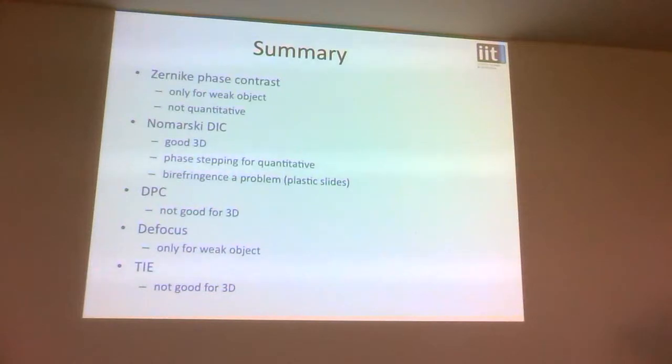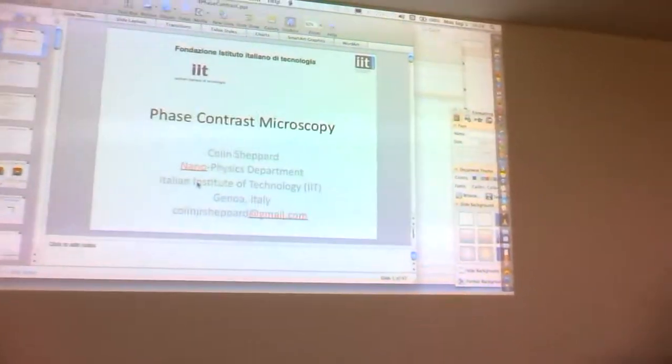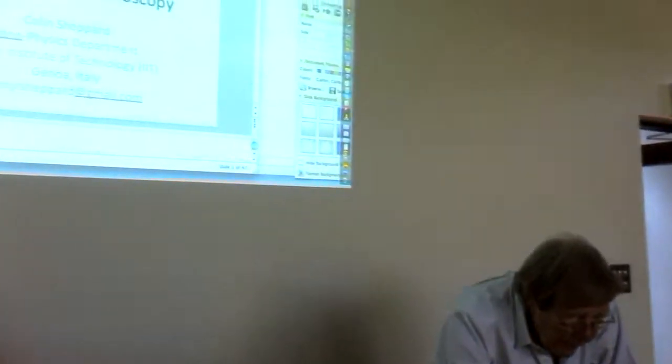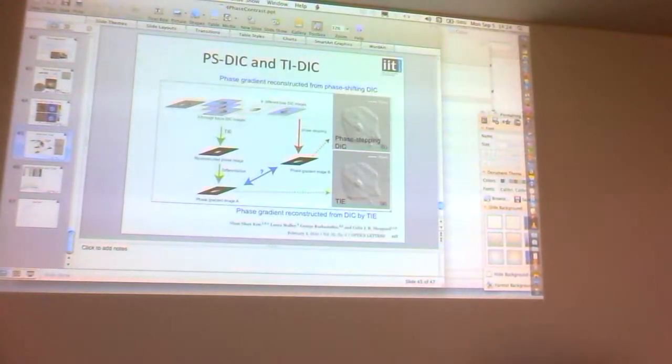Okay, so questions? Anybody? Questions? I have a question. You had the last 2 methods you were comparing there for getting out the phase. Yeah. I think there were almost two different algorithms as opposed to. Oh yeah, that was one. The second last. This one. Yes, I was just curious what happens if you subtract these two from each other. Do you just get noise, or is there a real difference?